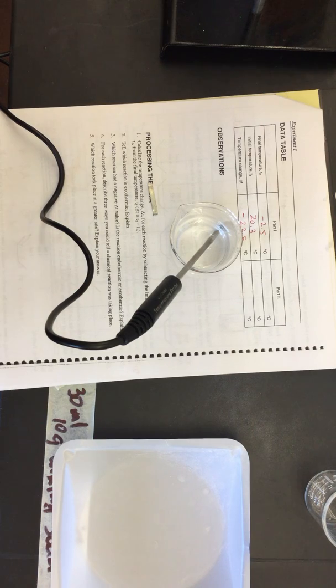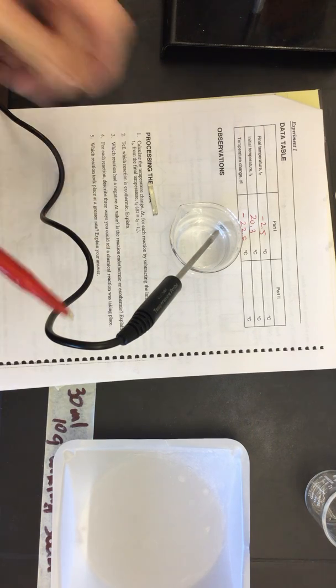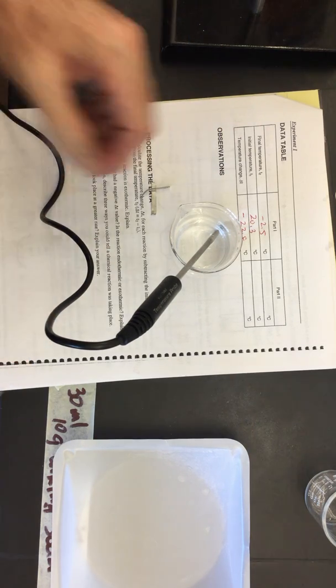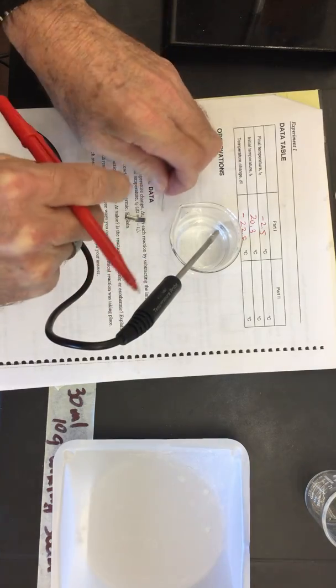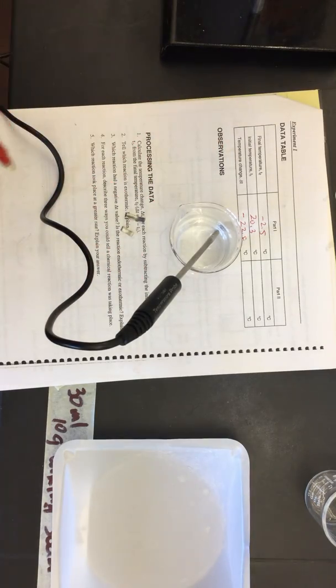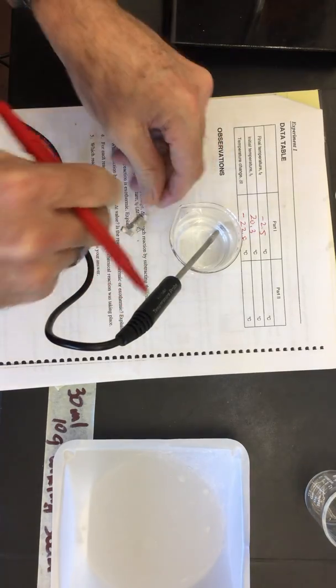I'm just going to try to break it into a few smaller pieces so it's going to fit nicely in there. And we're going to take a look at what happens with this. I'm also going to be resetting the graph.